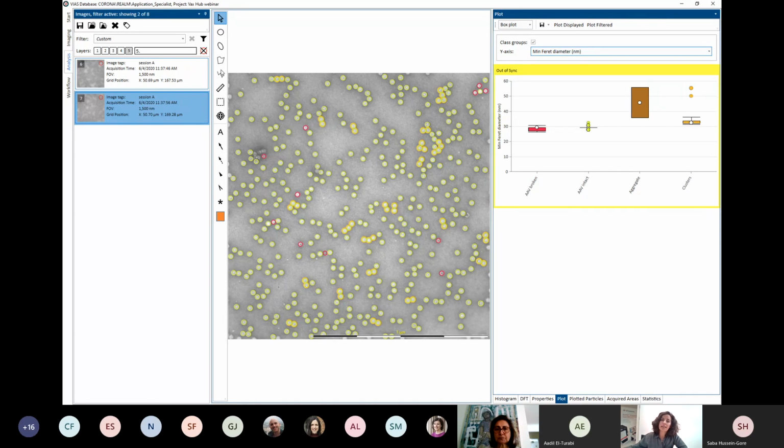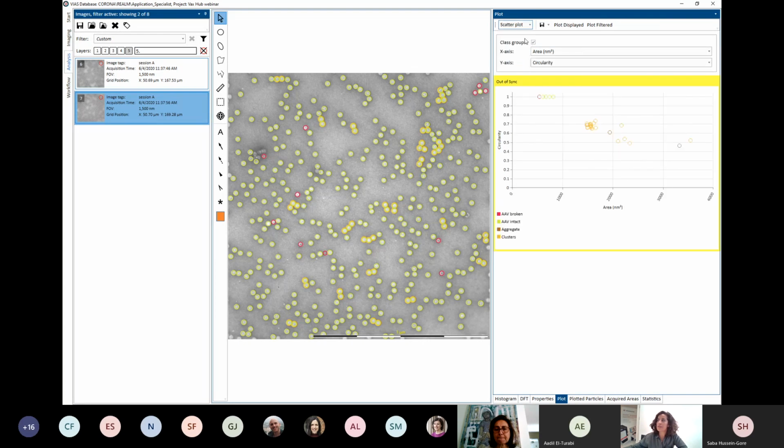Yeah, exactly. And for me, one of my real favorite things is you can take something here that is an outlier or a subpopulation like this, and you can really go into it further and further and find out what this was. Is this real? Is this something that is of value? So yeah, if we have some samples like this, let us run it here and let us really dissect it effectively.